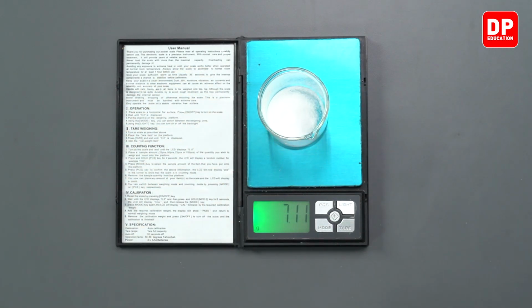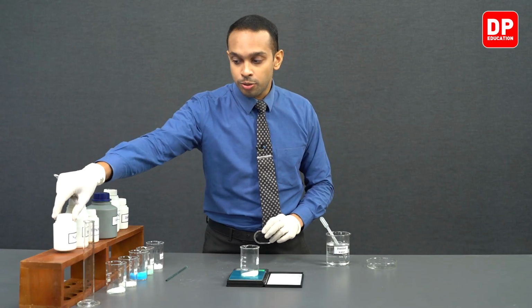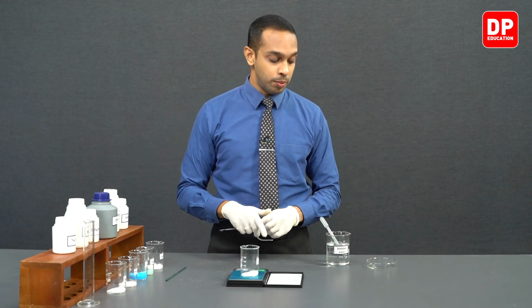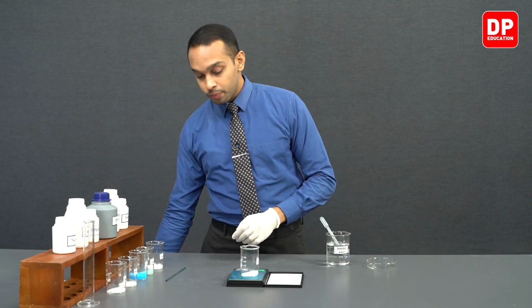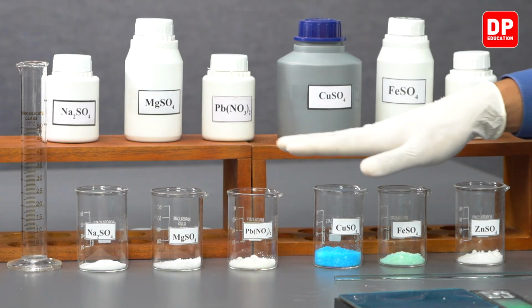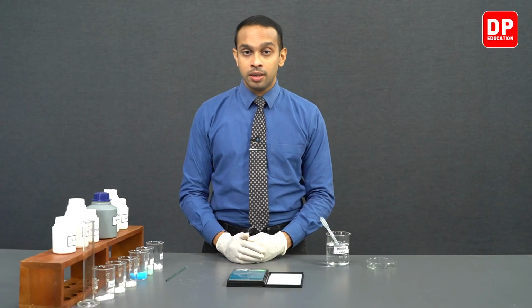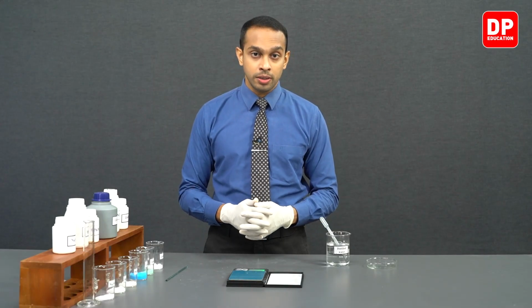We have measured 7.11 grams of sodium sulfate. This mass will be sufficient to prepare the solution that we need to prepare. So now students, we have measured the masses of these salts that we need to prepare 1 mole per decimeter cube concentrated solutions of each of these salts. And now it is time for us to add the relevant volume of water.